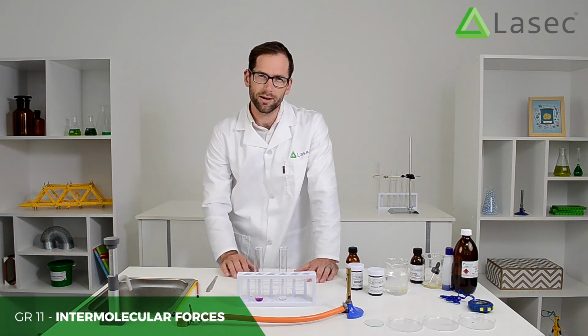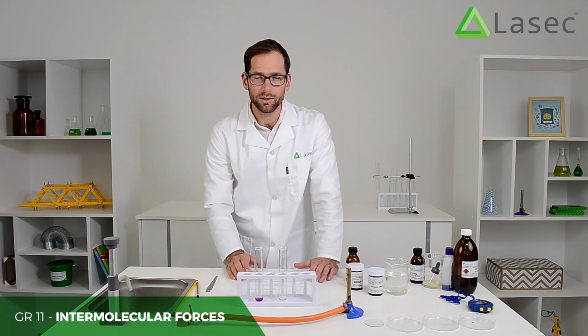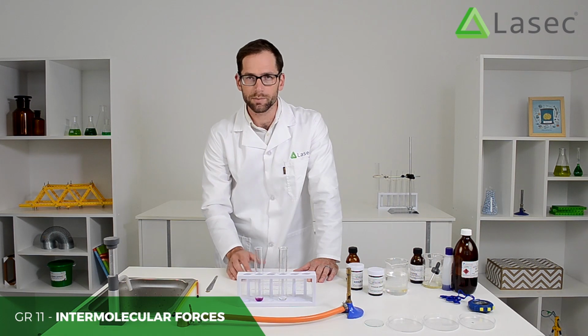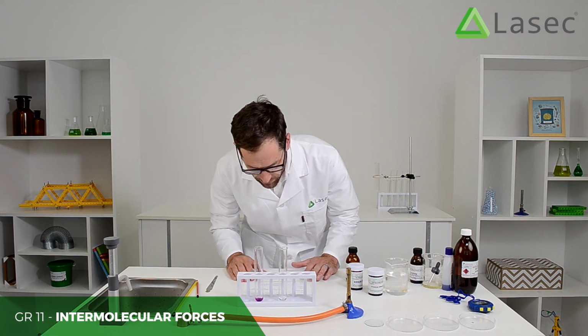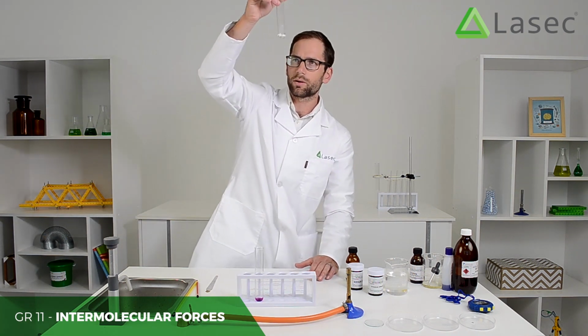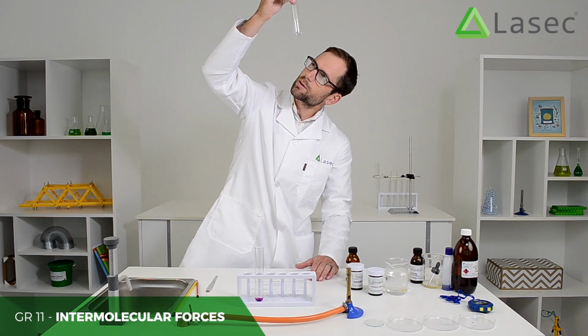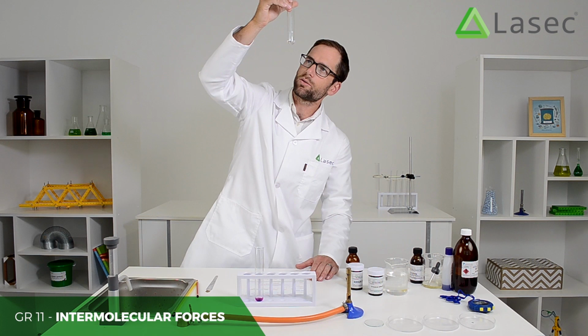So what the learners are doing now is observing. They're timing how long it takes for the crystals to dissolve in the solute, in the water, and just observing what happens. And here I can see that the sodium chloride crystals, I can still see them. They're visible in the test tube. I'll hold it up to the light, but there's a lot less of them than we started off with. Now I know that those have now dissolved into the water.